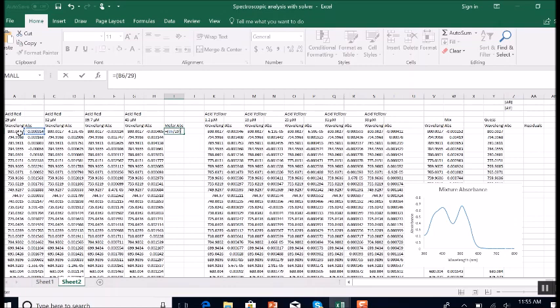Now we actually tried to measure the molar absorptivity at multiple concentrations, and it would be better to include all of those in an average molar absorptivity. So let's actually calculate an average. So let's add to this the absorbance of acid red at that same wavelength, but at a different concentration. So I'm going to divide by the next concentration, which was 32 micromolar. And to get an average, I add all of these together. This is 39.7.